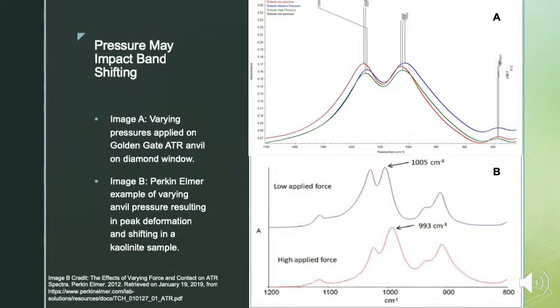Now there are two things that can affect the uniformity of contact between the sample and the IRE. First, the varying pressure from the anvil may leave some air gaps between the sample and the IRE. Some ATR accessories come with a pressure gauge that would make replicating the amount of pressure achieved a bit easier. However, the second effect can come from non-uniform particle size and shape of the sample.